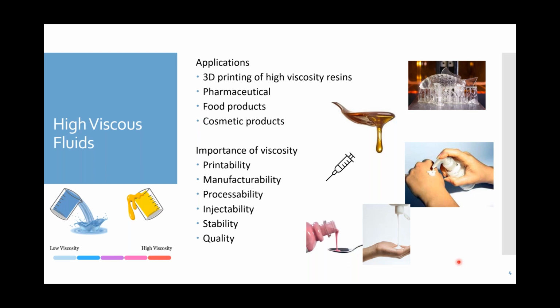In the biopharma industry and particularly drug development, viscosity is a critical parameter for screening candidate drugs in the early stage of development. In the final steps, however, viscosity is used to determine the injectability, and with that I mean the maximum injection force limit that ultimately is used to evaluate the ease of injection or the delivery of drugs into the body.